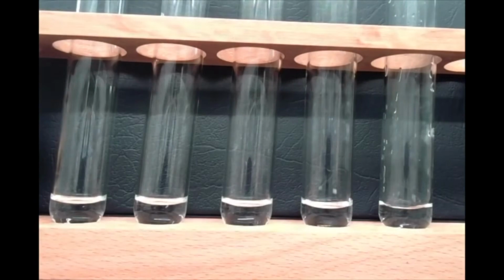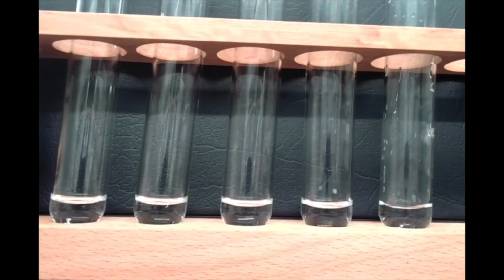Alright, I've gone ahead and added a dark background here to our 5 test tubes, each with 2 milliliters of hydrogen peroxide. Hopefully that'll make things a little bit easier to see. And as I mentioned, I might take a close-up with my cell phone to give you some different footage if it's a little bit hard to observe what's going on.